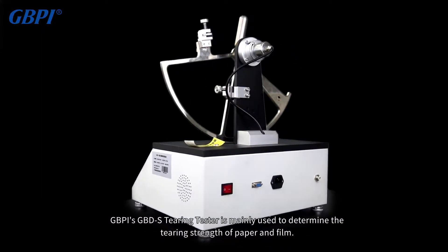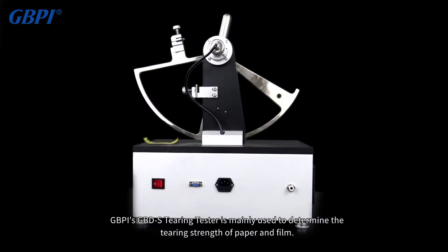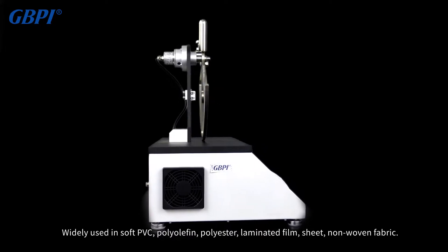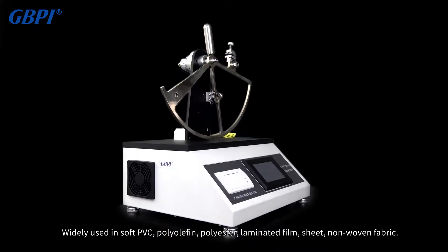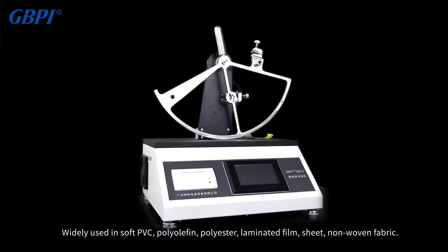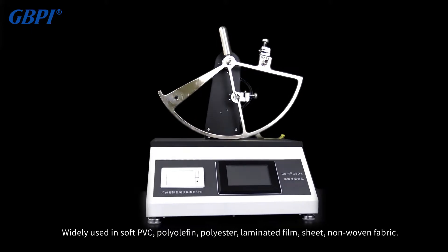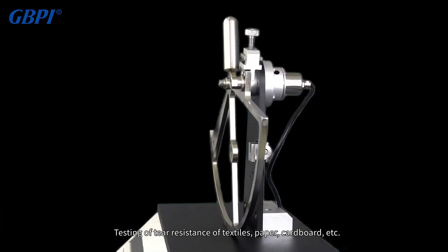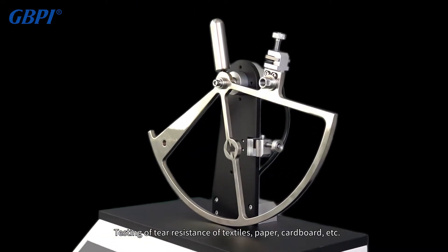GBPI's GBDS tearing tester is mainly used to determine the tearing strength of paper and film. It is widely used in testing the tear resistance of soft PVC, polyolefin, polyester, laminated film, sheet, non-woven fabric, textiles, paper, and cardboard.